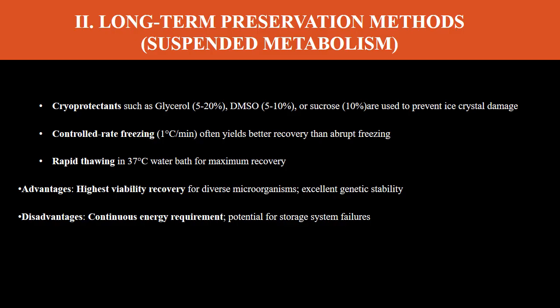The advantages include highest viability recovery for diverse microorganisms and excellent genetic stability. And the disadvantages include continuous energy requirement and potential for storage system failures.